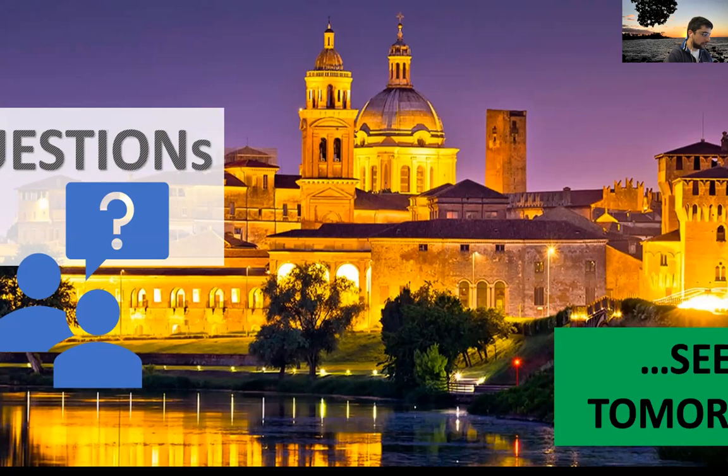I hope that answered your question. But again, we'll see tomorrow the best practice for indexing is going to be unique dual. Okay, and I'll show you tomorrow that will minimize the index misassignment. Okay.